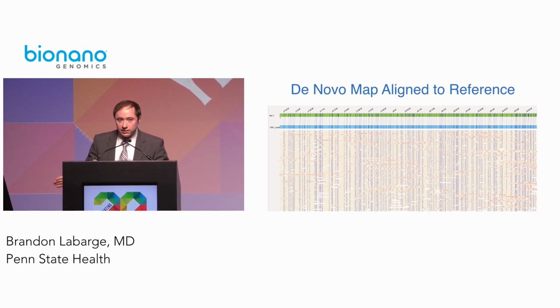The digital molecules look like this, and the overlap of the labeling then allows you to create a genome map shown in blue for your source material, so for us, usually cancer. And then the HG38 reference here shown in green. They're both stained with the direct label enzyme, and so then you can compare your genome map to the reference to describe any structural variants.